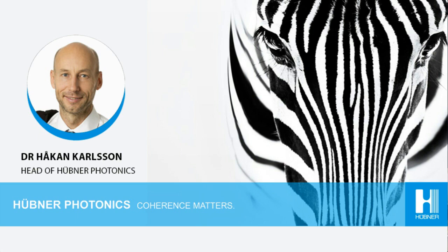Another question. Are all your lasers single longitudinal mode? The diode pumped lasers that we are talking about here are all single longitudinal mode, yes, which means that they have very narrow line width, much narrower than actually needed in Raman spectroscopy. The frequency locked diode lasers that we also provide for Raman spectroscopy are not specified to be single longitudinal mode.